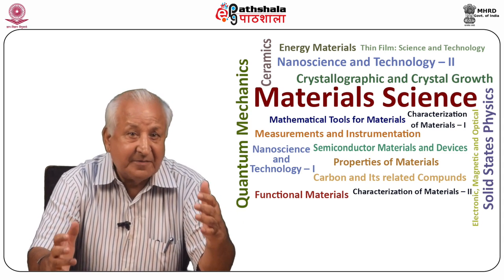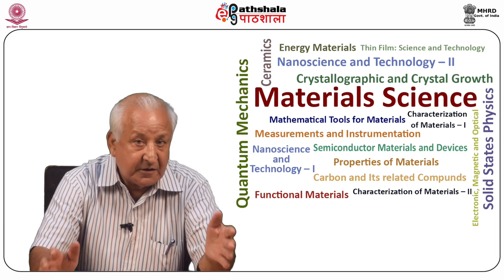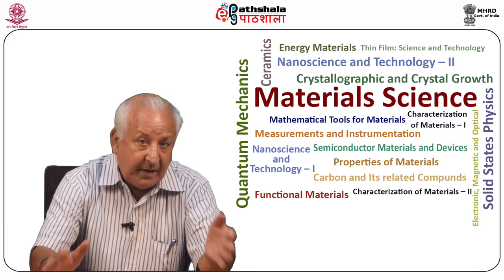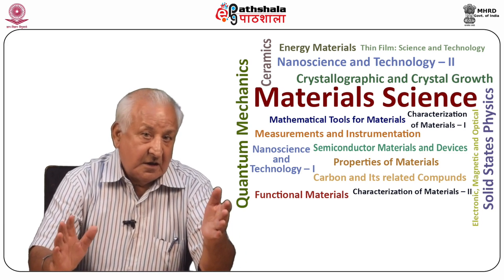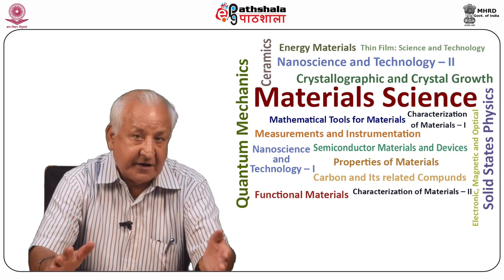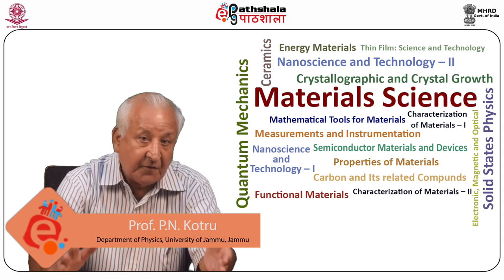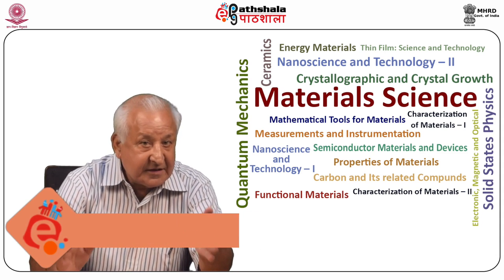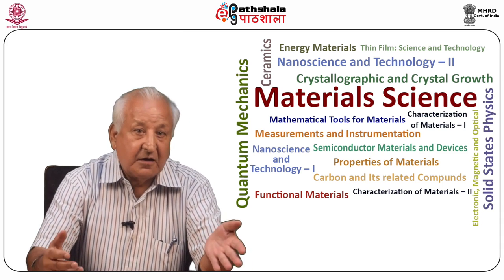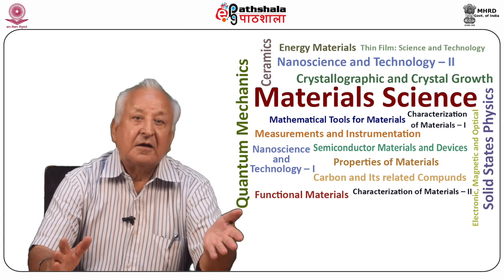We have learned about the experimental techniques of X-ray diffraction, the assessment of defects in crystals, which have been described and discussed. The techniques of Berg-Barrett, also known as Newkirk, in symmetric and asymmetric Bragg reflection, have been described and explained. Lang technique of X-ray topography is also discussed. Examples of topographs and diffraction curves which reveal defects of some crystals are given and explained with full description.